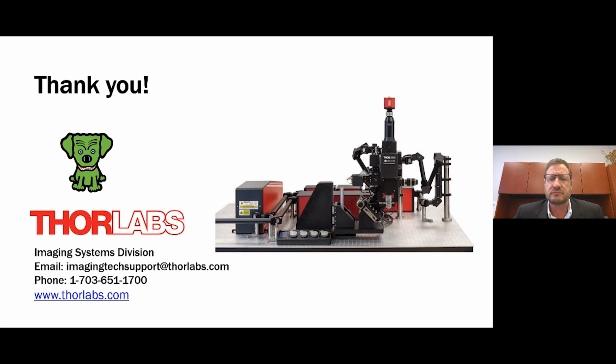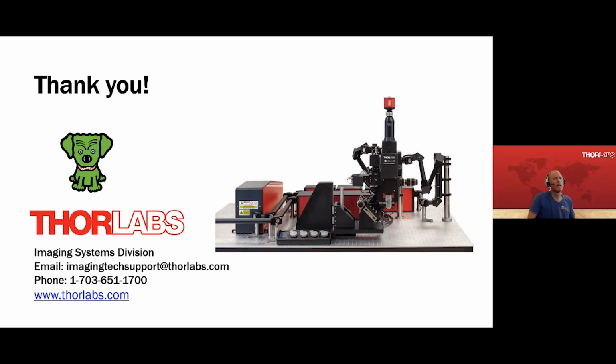Probably this one goes over to Brian. Are the mechanisms of 2P background production different from 3-photon? That is, do the different background molecules in autofluorescence behave differently in 2-photon or 3-photon? That's a good question. I actually don't know the answer to that.